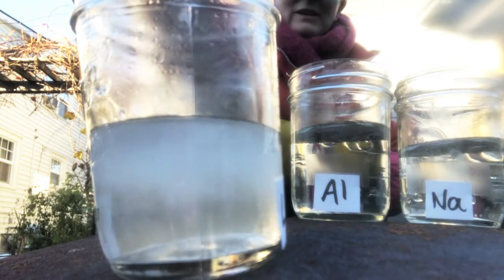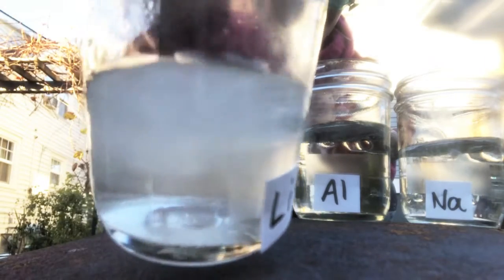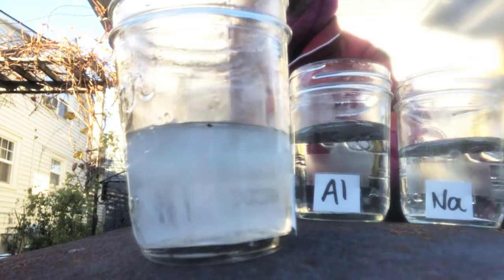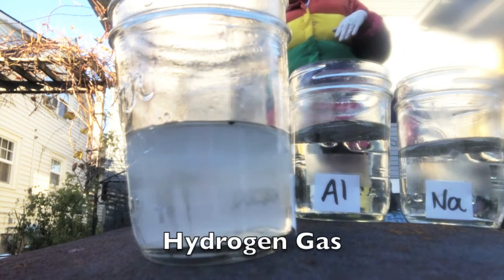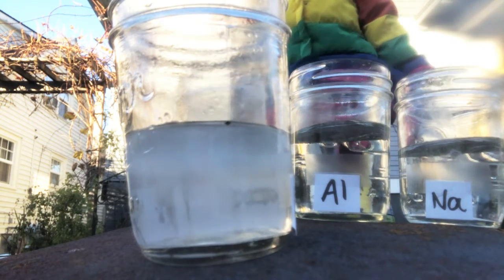But you'll see it's kind of dancing around. It's moving around. You can kind of smell what's coming off of it, and it's not very pleasant to smell. It is hydrogen gas that is coming off of that reaction.